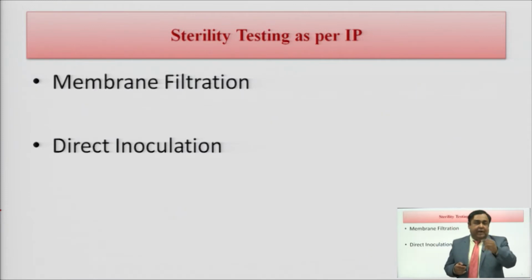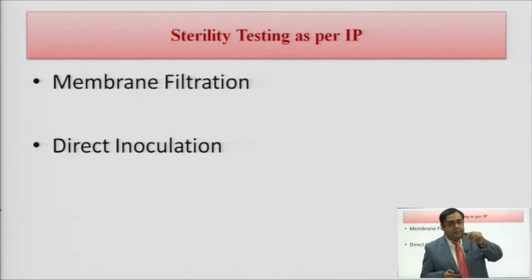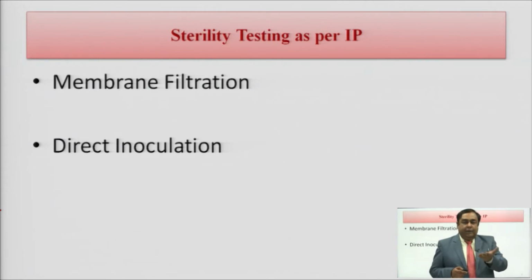If there is any bacteria or fungus present in the preparation, they will be retained on the surface of the filter paper, and that filter paper we need to put in or immerse in the bacteriological media.